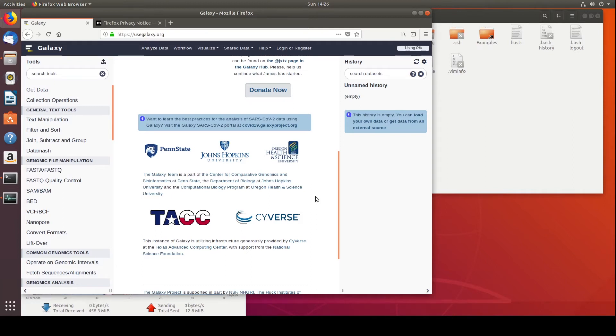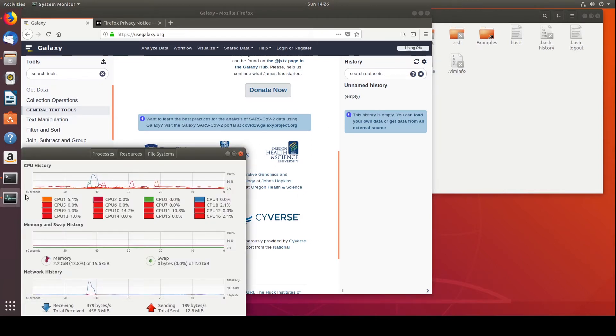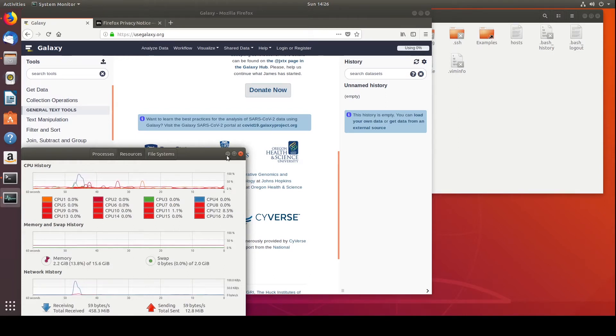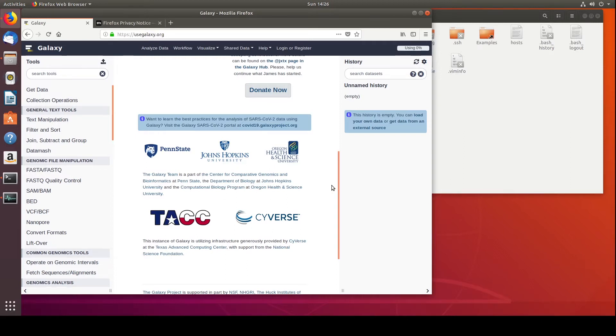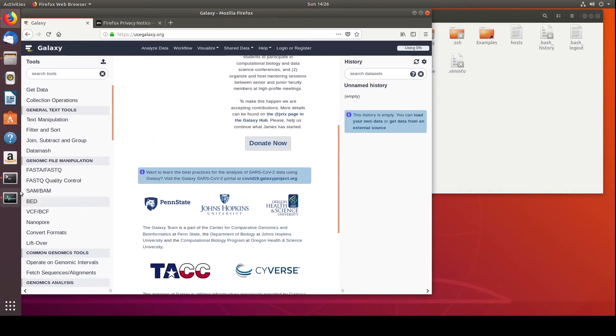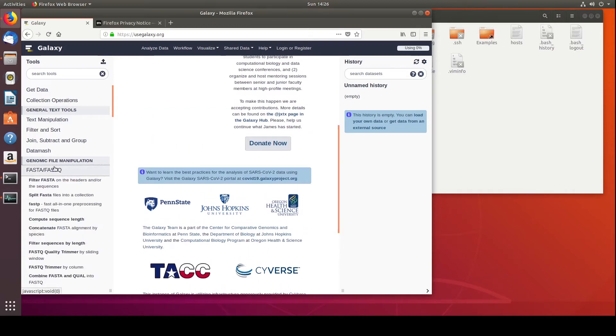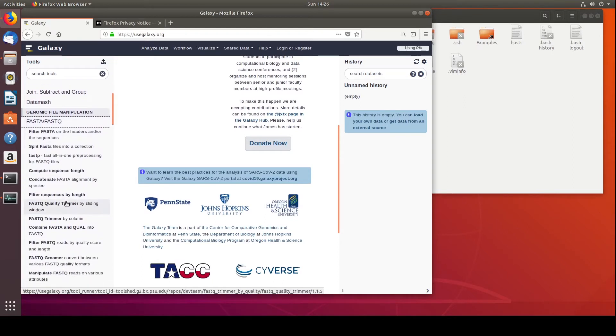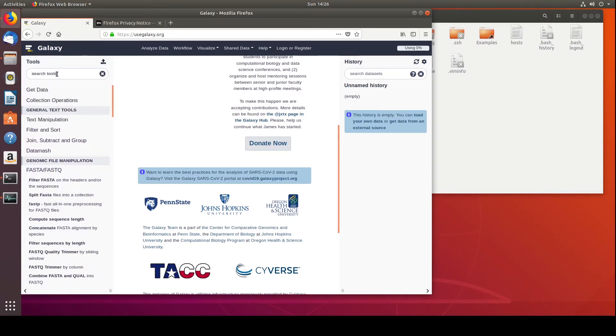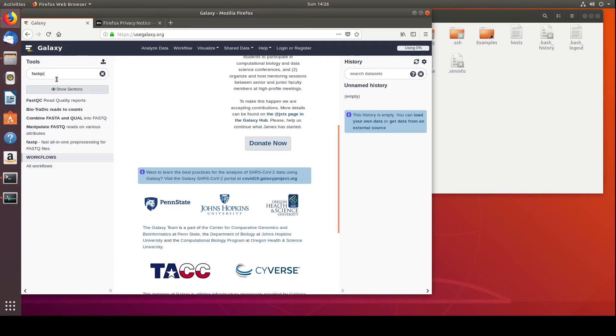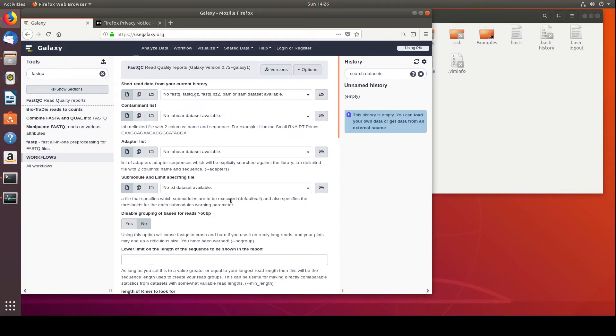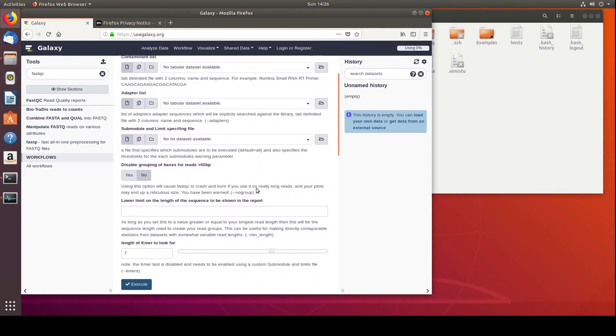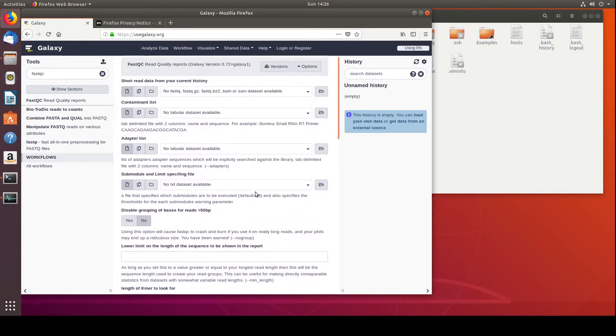If you don't have a local workstation like I do here, this is just a virtual machine on my computer, and I've given it 16 cores and 16 gigabytes, so nothing too extreme. But if you don't have a workstation, you could try, and if you are at an institution, you could try talking to some of the people that are at the cluster, if your university has a cluster, and see if they are able to install this. If you don't like the command line interface for running some of the tools, we should be able to see FastQC somewhere. Well, you can also search for them, so let's do FastQC. So here we have FastQC, which is really easy to run from the terminal, but just makes it a little bit easier, and it gives you information for each of the different inputs as well.